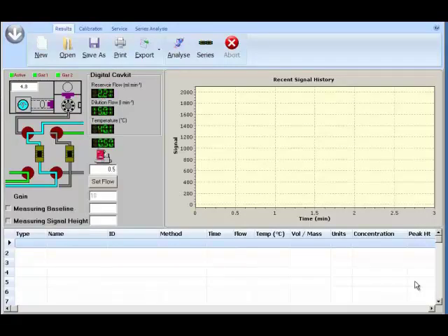With new SGV3 software, you have an option to do an automatic calibration if the software is connected to a sample mass flow controller and a PSA 10.536 calibration gas generator.